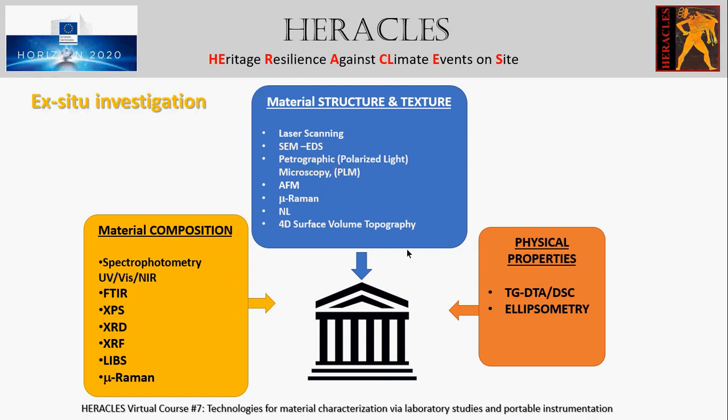For the study of mortars and materials collected in built monuments, the information on elemental composition helps the interpretation of results provided by techniques that are devoted to identify the mineralogical composition, such as X-ray diffraction, Raman, and FTIR. The X-ray fluorescence technique is considered non-destructive, since the sample recuperation is full.